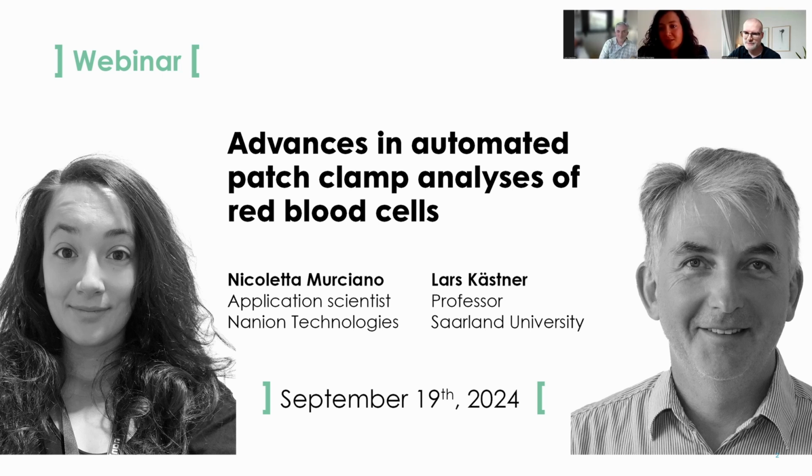So Piezo cannot reply to the mechanical stimulus also for this reason, and also the exposed portion is very small. And about erythroblasts, my hypothesis is that we have just more proteins replying better to the mechanical stimulus, compared to other techniques, of course. So in the whole cell configuration, the tension of the membrane can have an impact compared to other techniques.